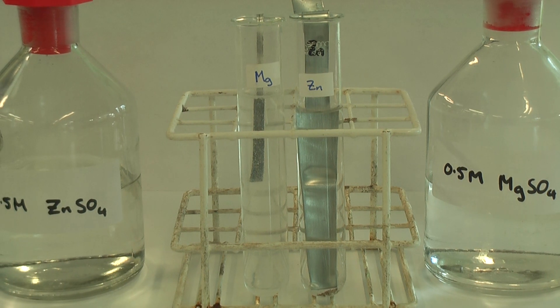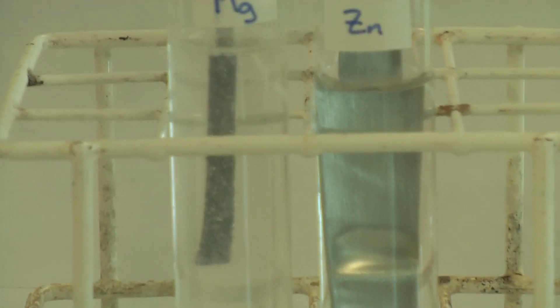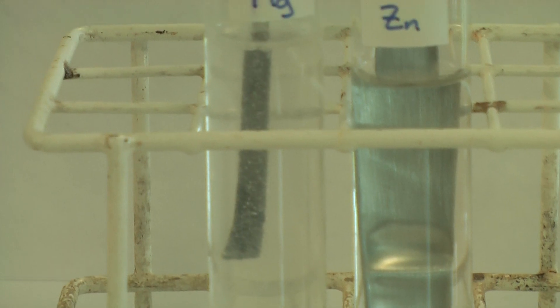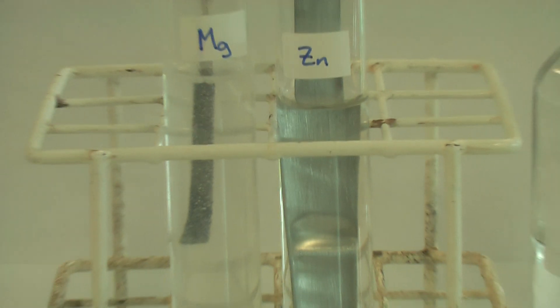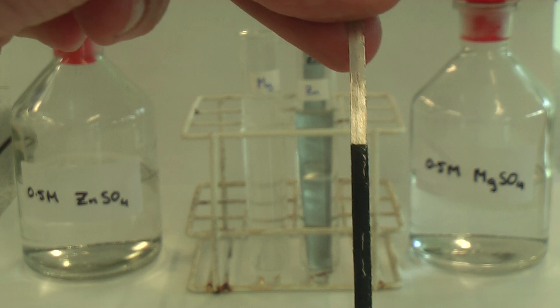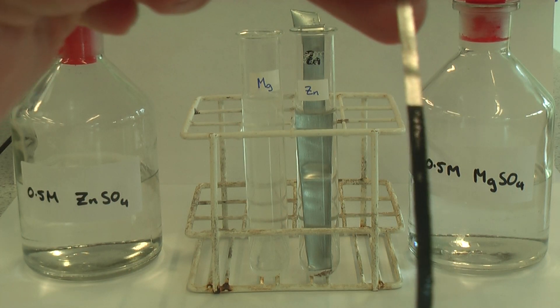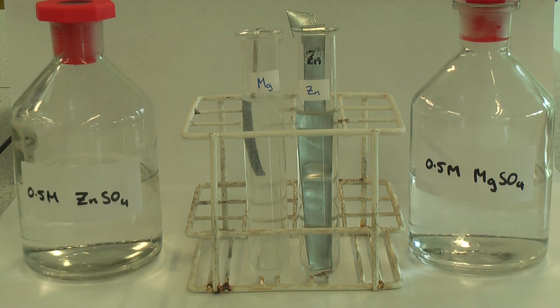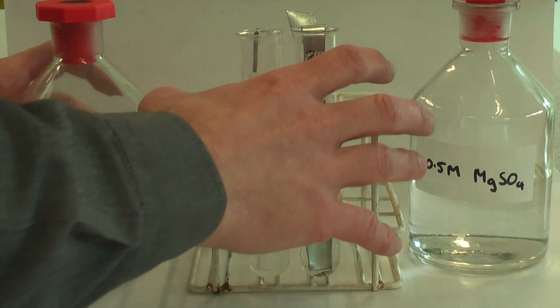The magnesium is reacting straight away — you can actually see some bubbles and the magnesium is turning black. There is nothing happening to the zinc in the magnesium sulfate solution. This shows that magnesium is more reactive than zinc because the magnesium is displacing the zinc from solution, telling us which ones are most reactive.